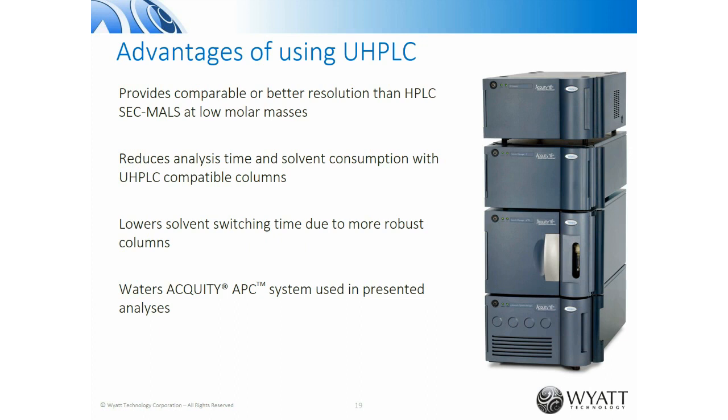The downside is that these smaller beads produce higher back pressures, but these columns are designed to be more mechanically robust. This, combined with a smaller column size, allows for reduced analysis time and solvent consumption. Additionally, since these columns are more robust, it also lowers the solvent switching time. For the analyses within this webinar, we used the Waters Acquity APC system, but there are other systems available for use.